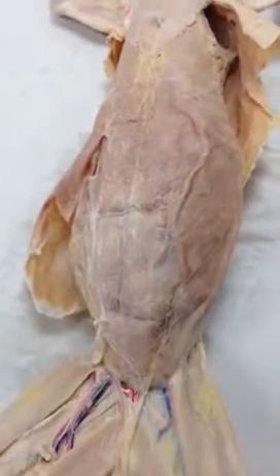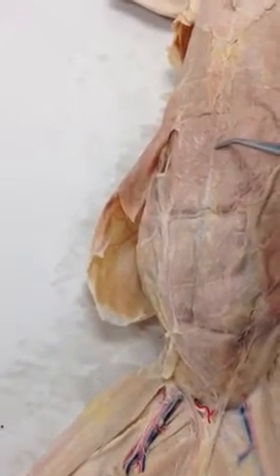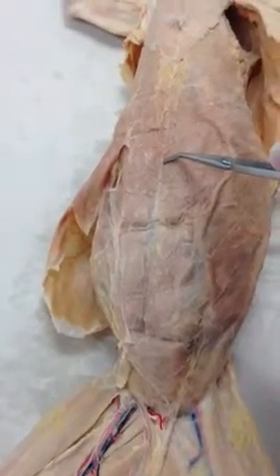Alright, we need to know four connective tissues. This right here is the linea alba.